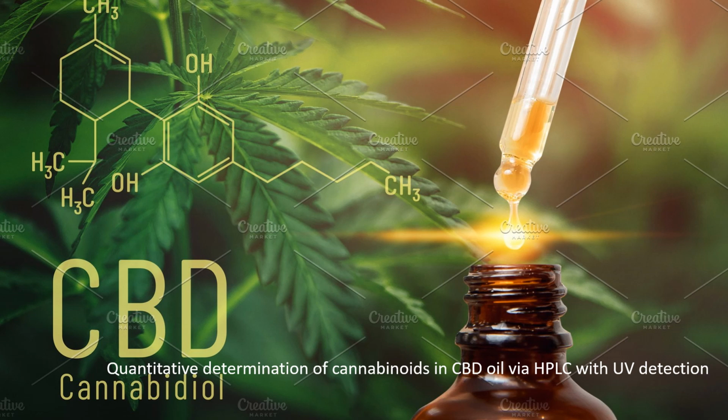Hello, my name is Cassandra Hill, and my research project was the quantitative determination of cannabinoids in CBD oil via HPLC with UV detection.